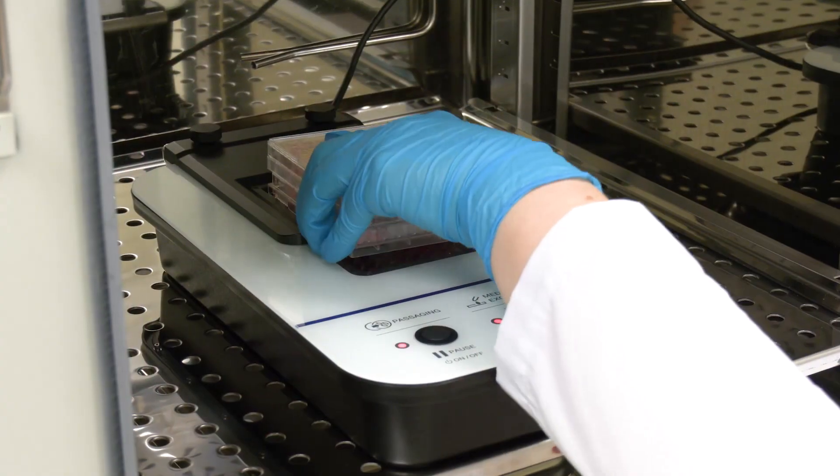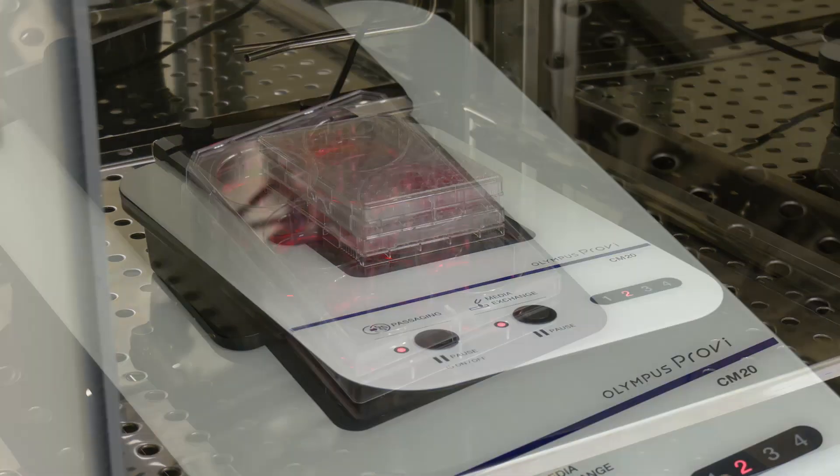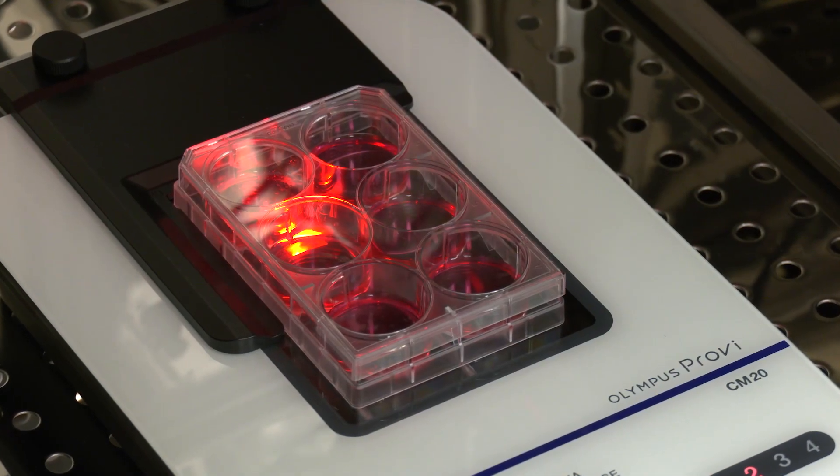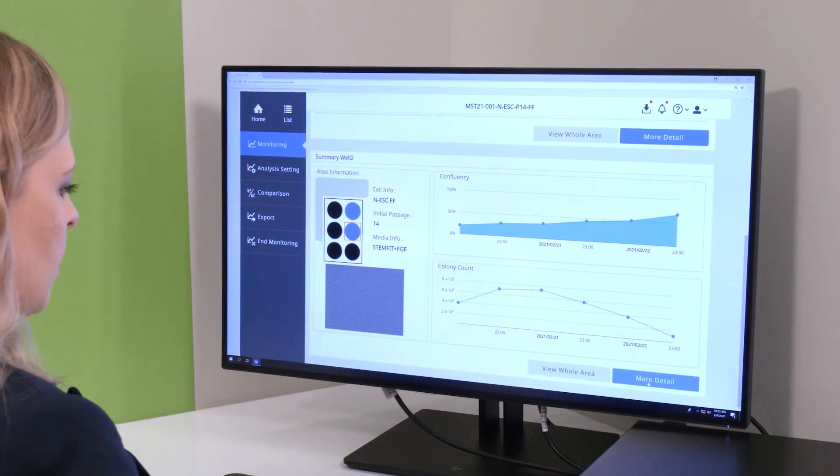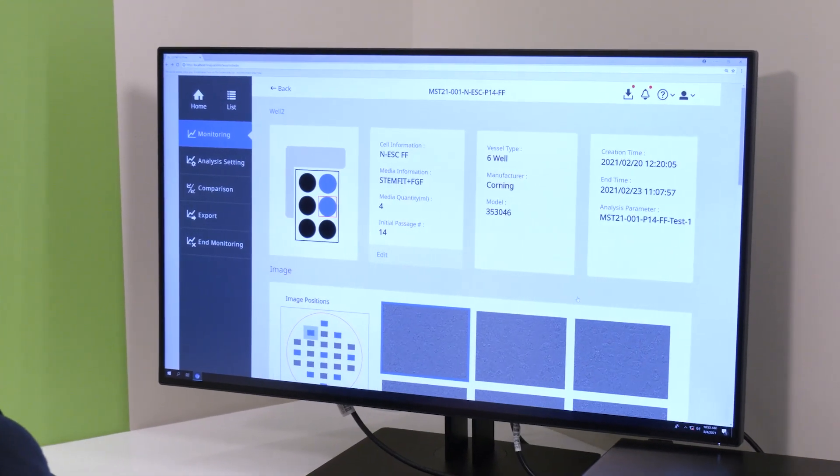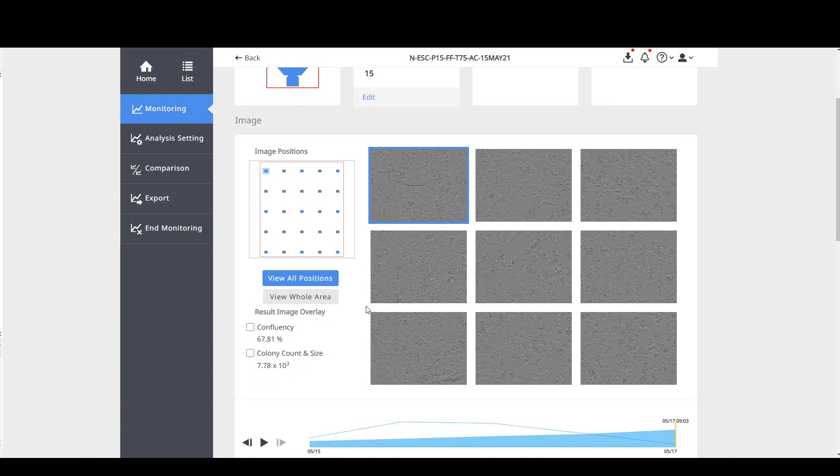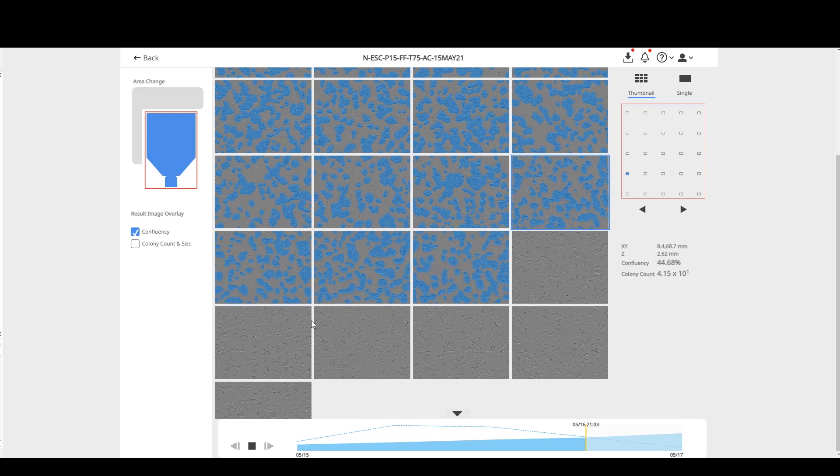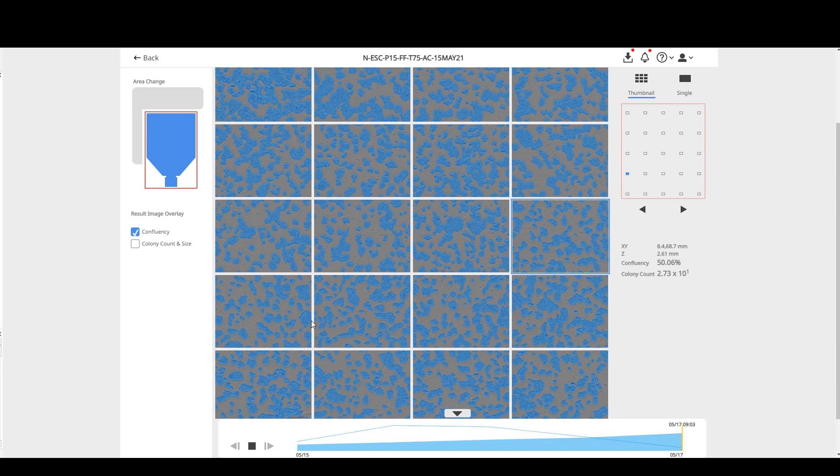The system will periodically scan multiple points of the vessel to provide a complete overview of your cell's health. Traditionally, we rely on our eyes to determine the quality of cell cultures, but if we use artificial intelligence to determine confluency, we reduce the user bias. The result is a more reliable cell culture workflow.